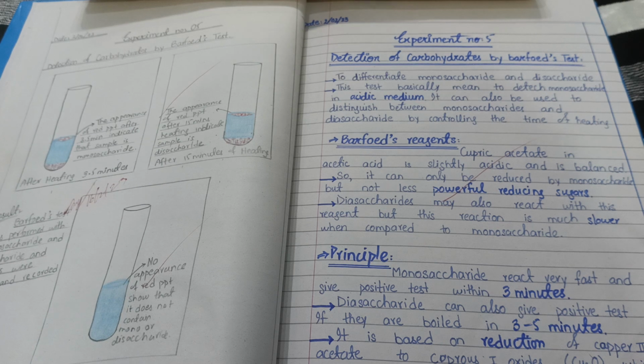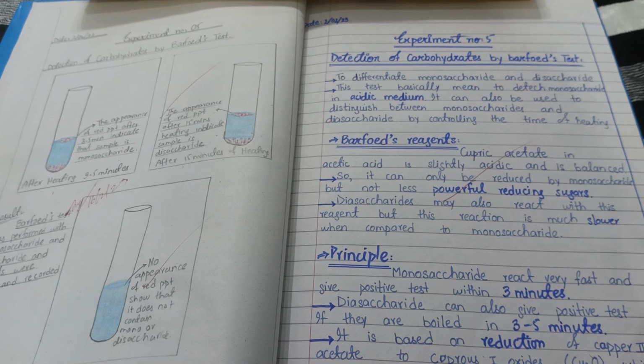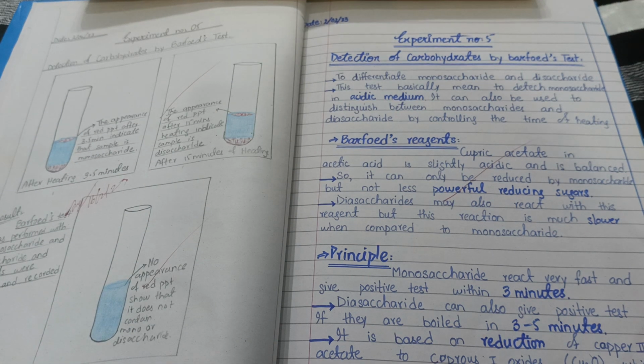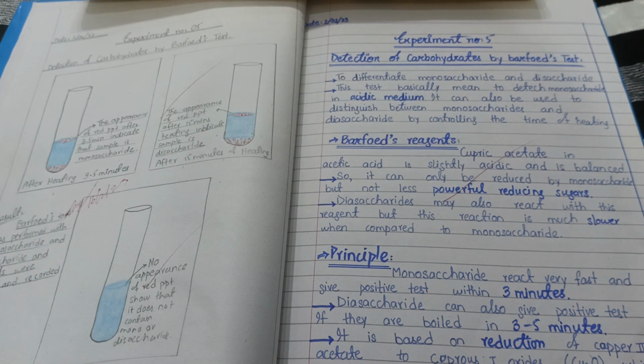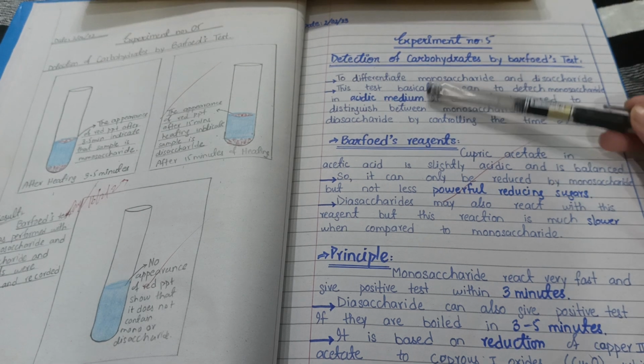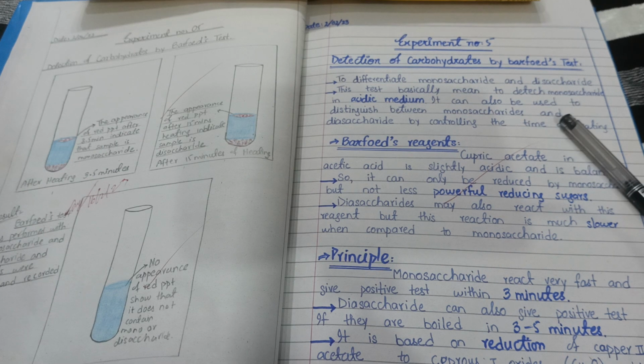Yes, you are right. Molisch reagent is only for all of the carbohydrates, sugary compounds. Okay. Now the Barfoed reagent is only to differentiate monosaccharides from disaccharides. Okay. And it always takes place in an acidic medium. Okay. So you have to mention the conditions for every experiment.